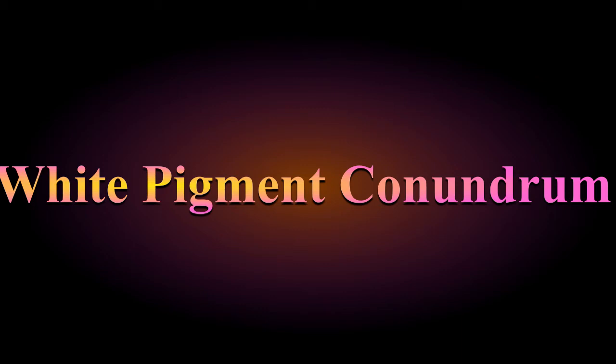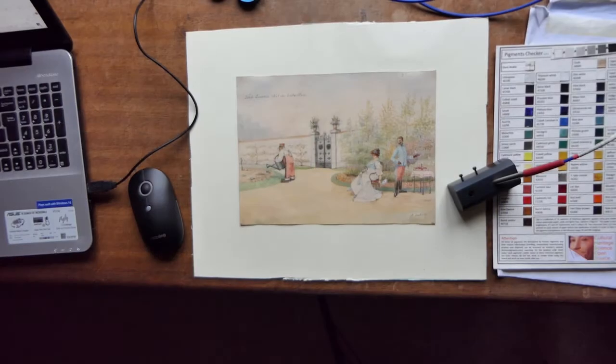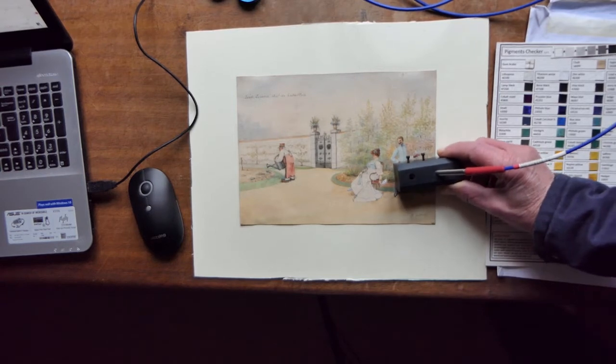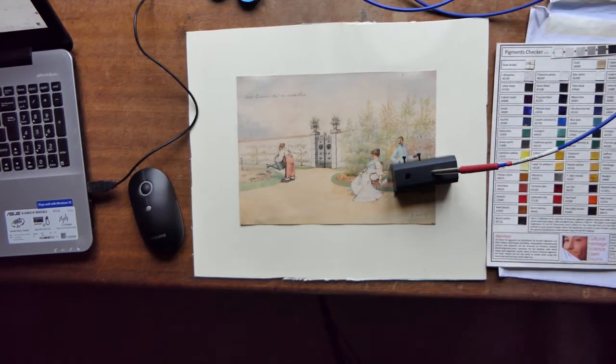This is a diversion to our study of pigments in a French watercolour. Now, my videos are in the real world of pigment identification. I don't know what's coming next. And we are diverting into an interesting anomaly with XRF, X-ray fluorescence, and FORS, that is, using a fibre optic reflectance spectrometer. You may remember the white pigment on the French watercolour.